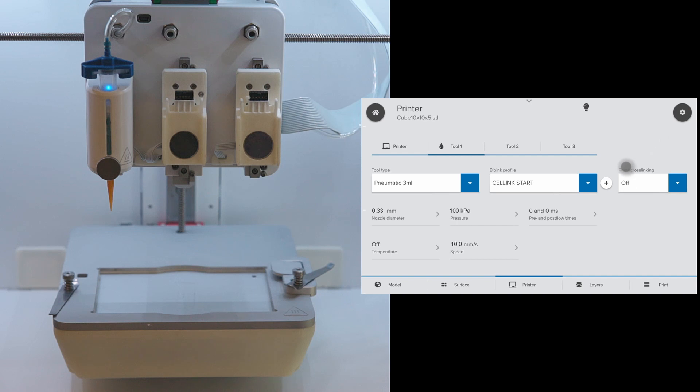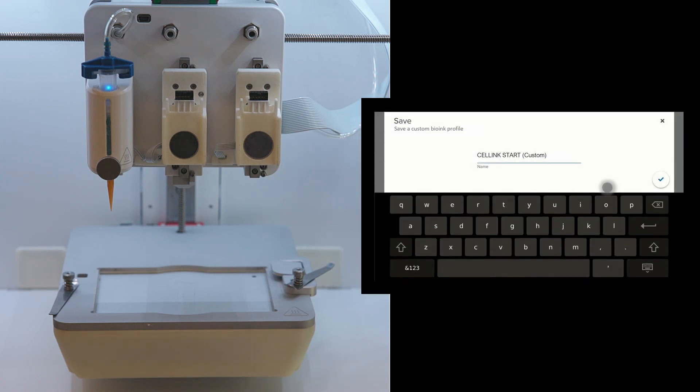Pre and post flow can be used for material that needs a moment to begin extruding or may still be attached to the nozzle after extruding. Next, click on the plus sign beside the bio-ink profile to save the profile. The current profile will remember the nozzle diameter, the extrusion pressure, the print speed, pre and post flow information regarding the bio-ink.